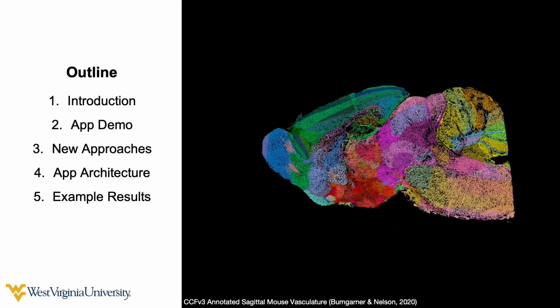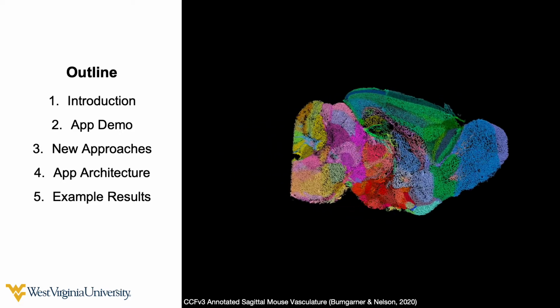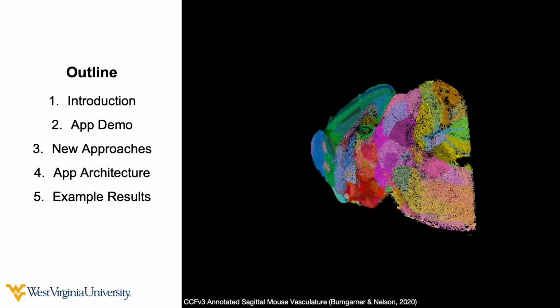In this brief presentation, I'm going to give a bit of a background on my motivation for building the app, give a brief app demo, describe new approaches I've taken, and then finally highlight some example analyses that I've conducted.